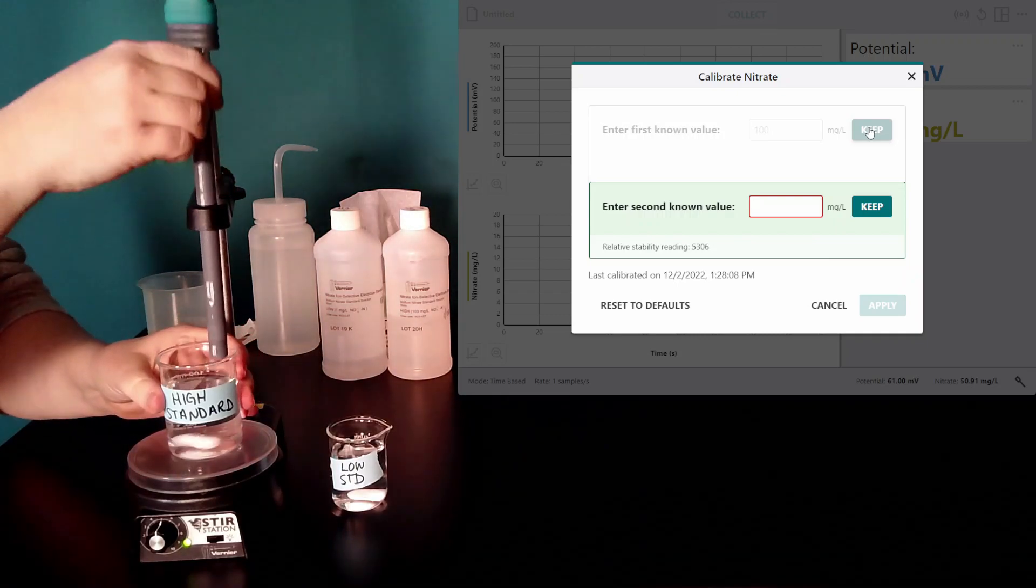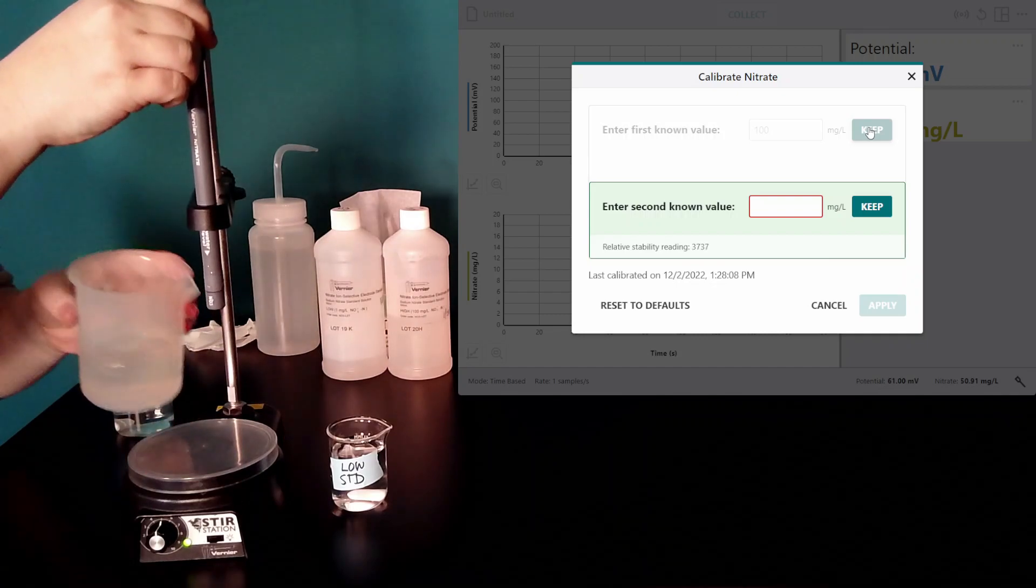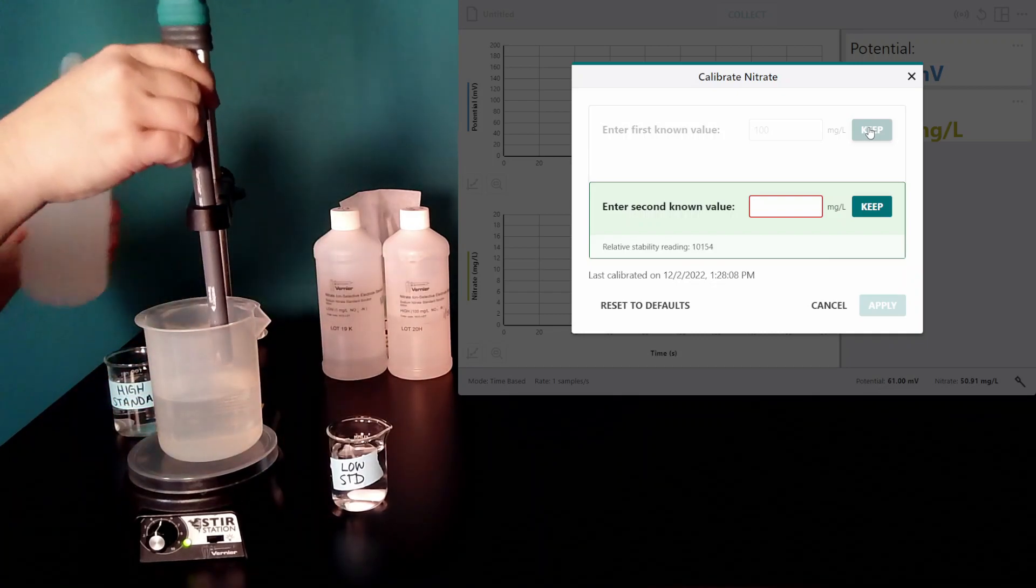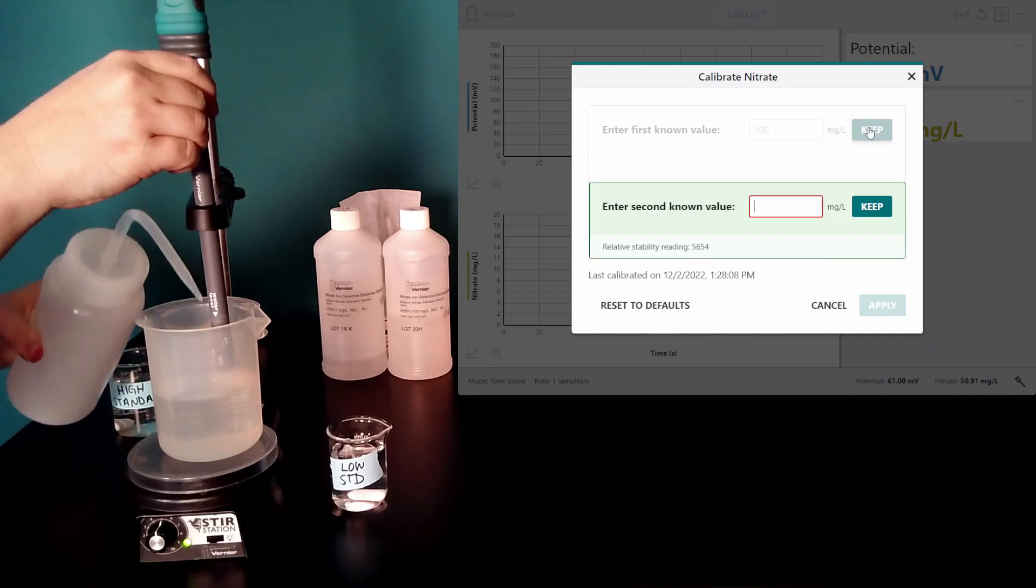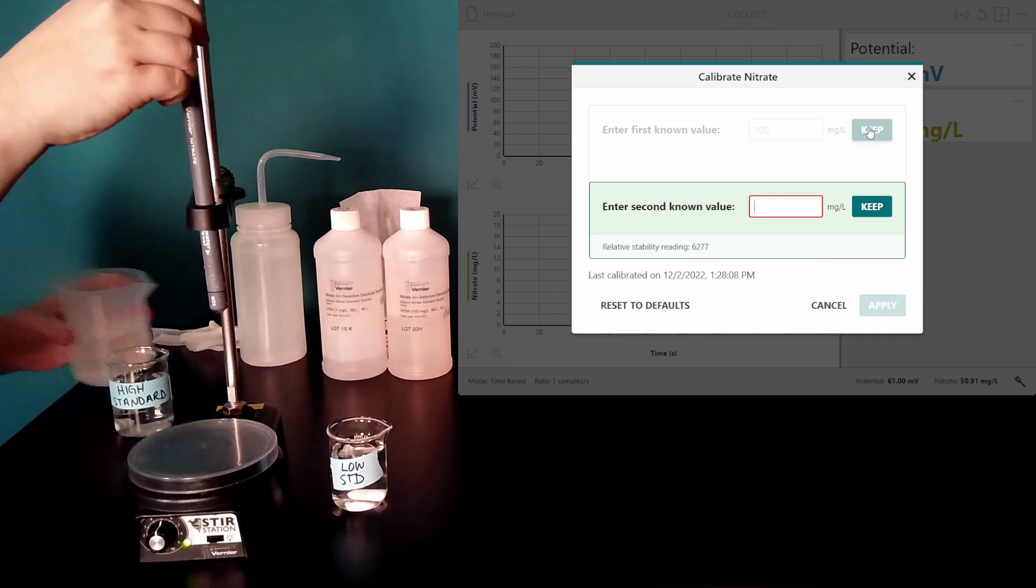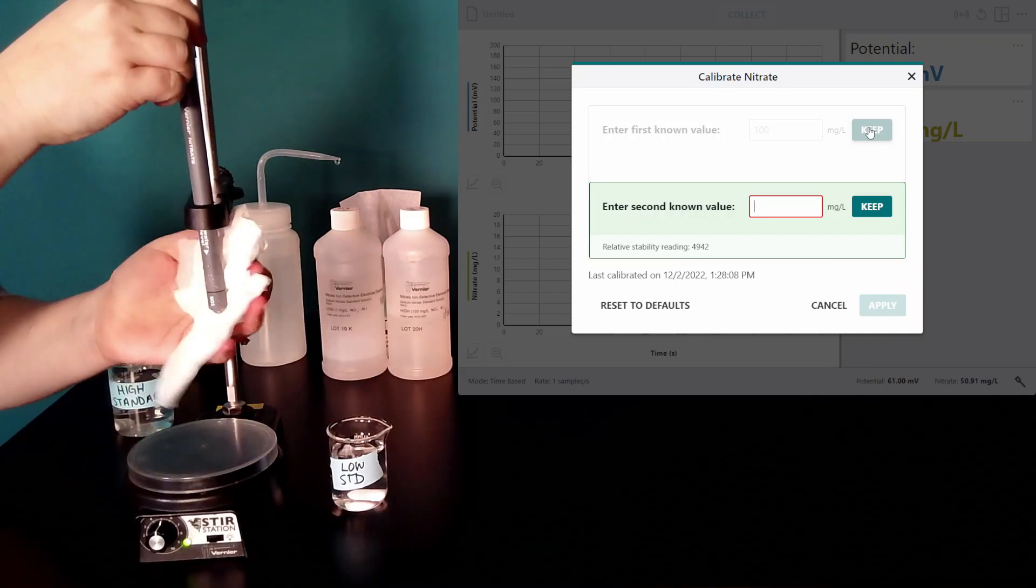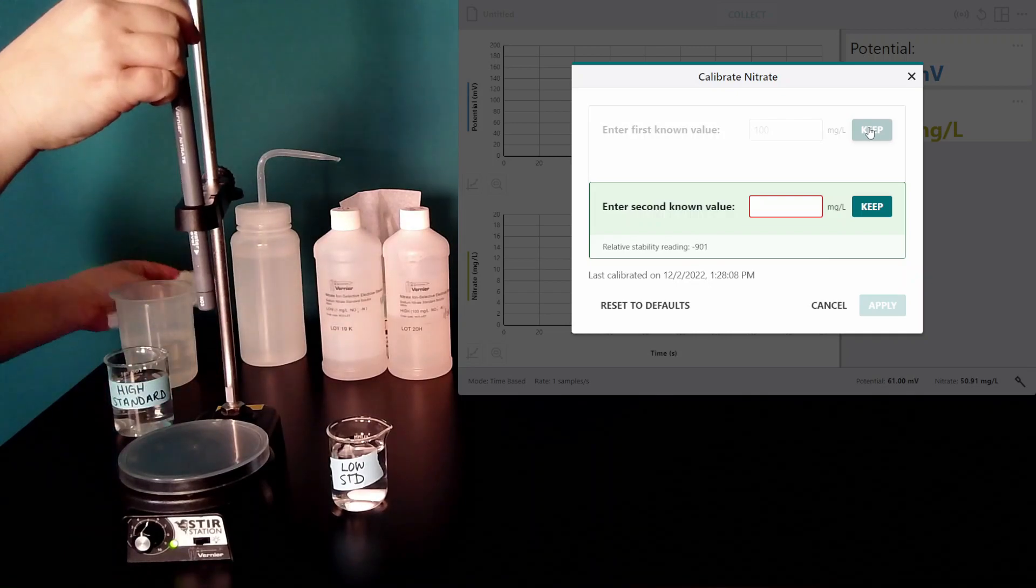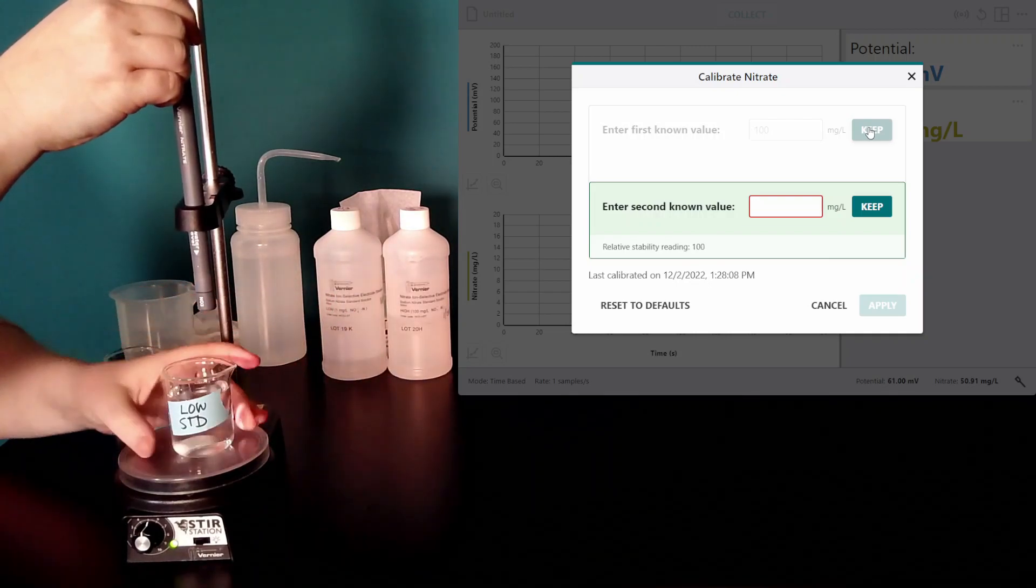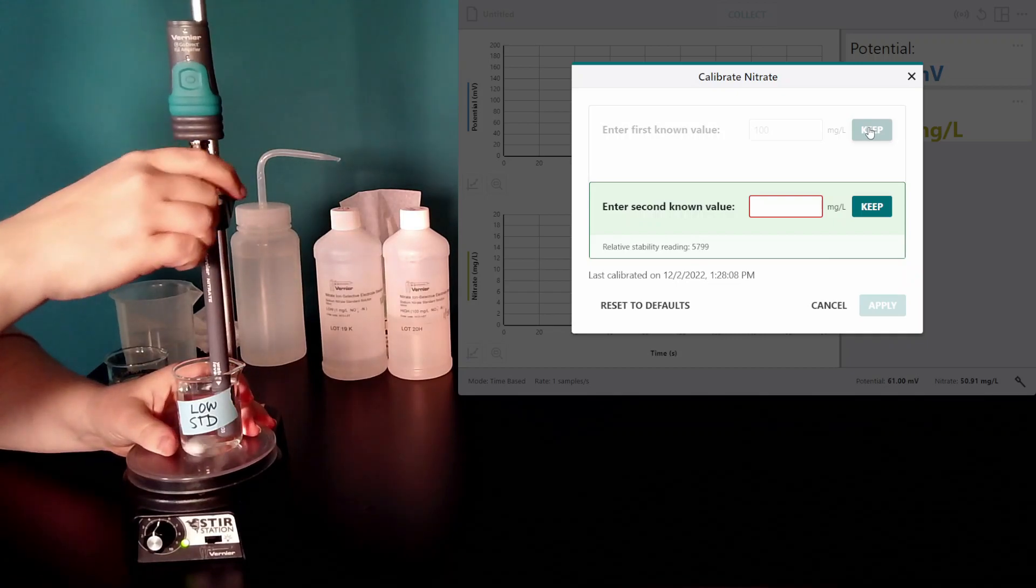I want to make sure I rinse my electrode first with deionized water, and blot it dry with a Kimwipe, and put it in my low standard.